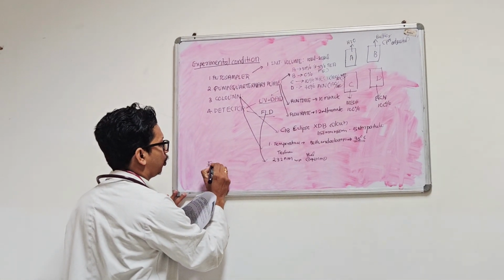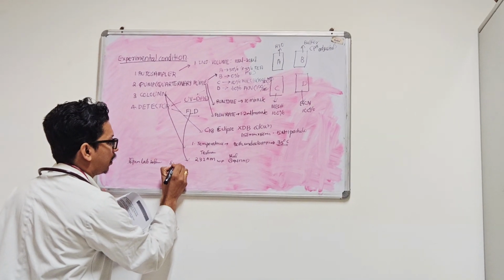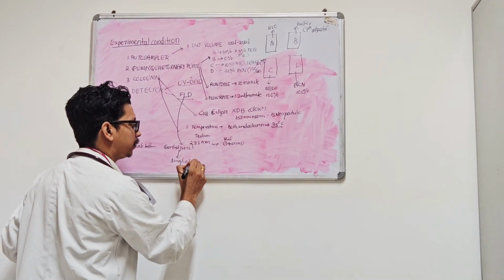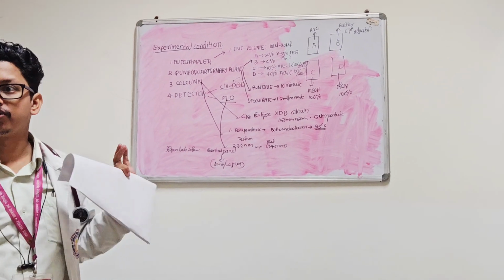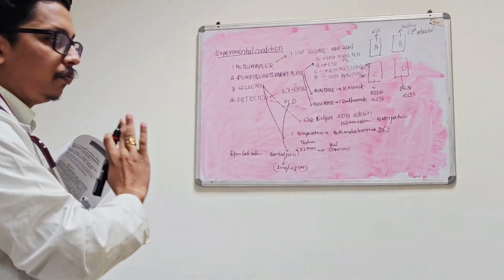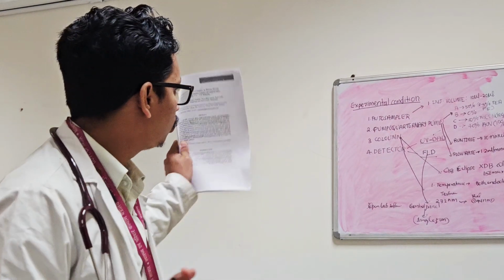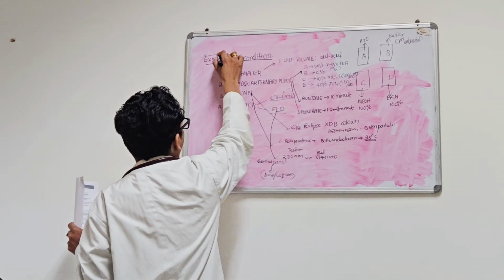In OpenLab software we go to the single run control panel, select single run, select the configuration and method, select how many times to repeat, and put the run. Then the first run will occur. If we put 3 runs, first run, second run, third run, repeat 1, repeat 2, repeat 3 occur, and we will get the chromatograms. So this is the method by which we configure the experimental conditions of the HPLC.